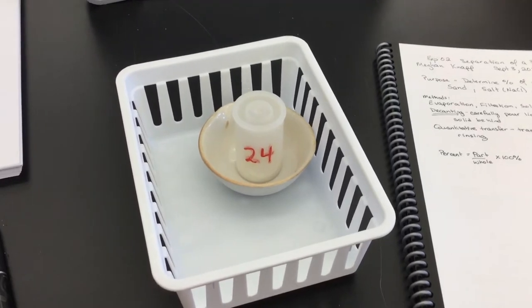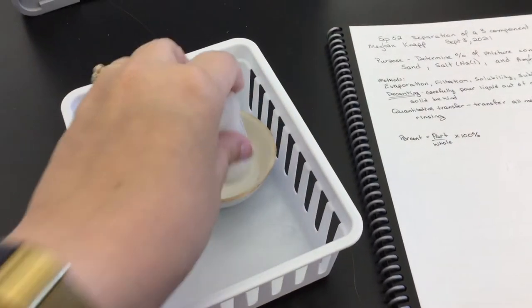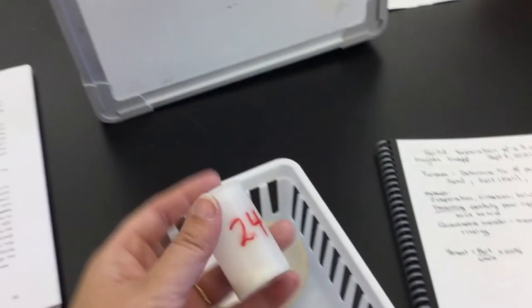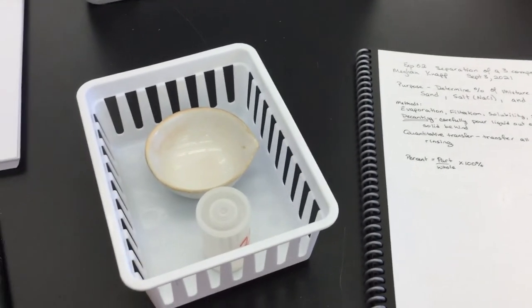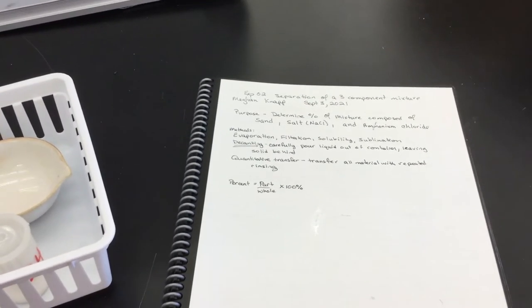For this experiment, you will find in your basket an evaporating dish, which is this bowl, and you will find a film canister with a number and your mixture in it. You will also want to make sure that you come to lab with your lab notebook prepared. Remember that each professor has different ways of collecting your report, so check with your professor on how you will be turning in your reports this semester.